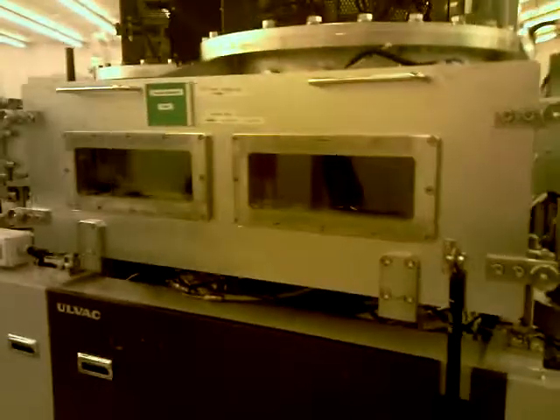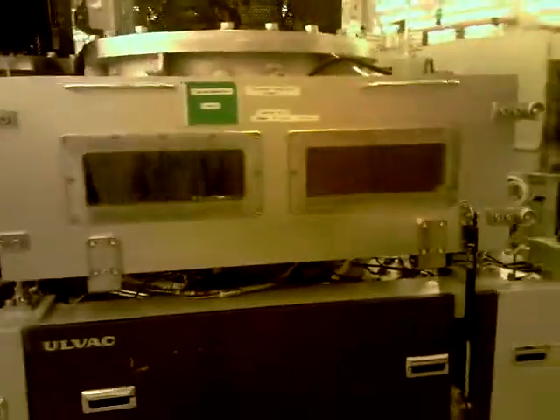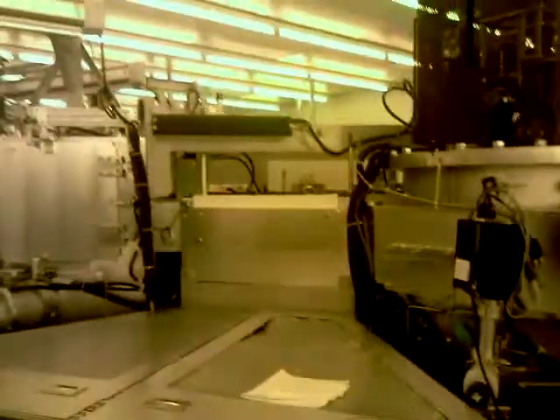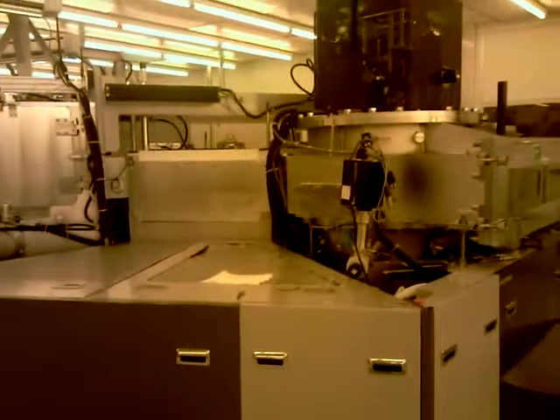Here you can see the main machine — we have some vacuum pumps there, this is the chamber, and here is where the deposition takes place. In this chamber there is organic evaporation. It's a very nice setup, very reliable. That's the whole setup — anyway, thank you, bye.